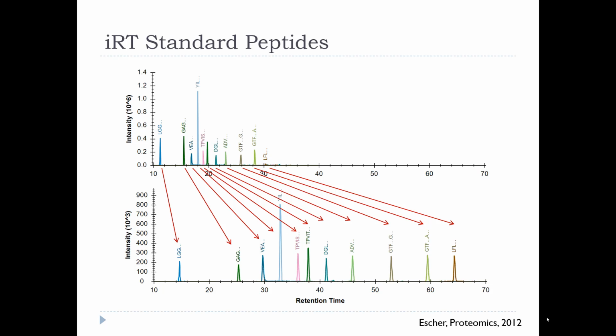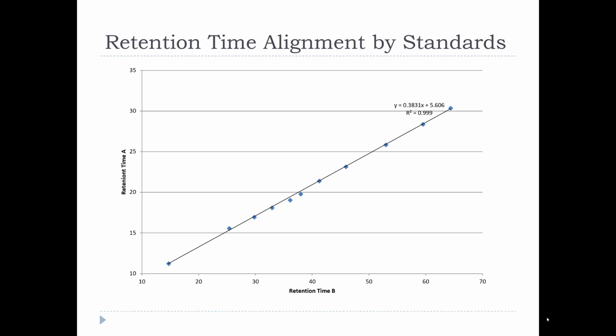So if we inject standards, we get these landmark peptides. We could also choose landmark peptides just from our samples.